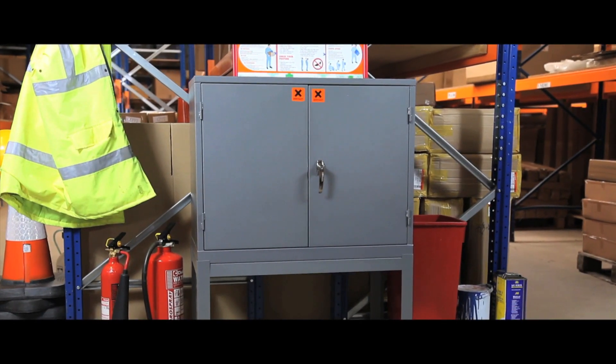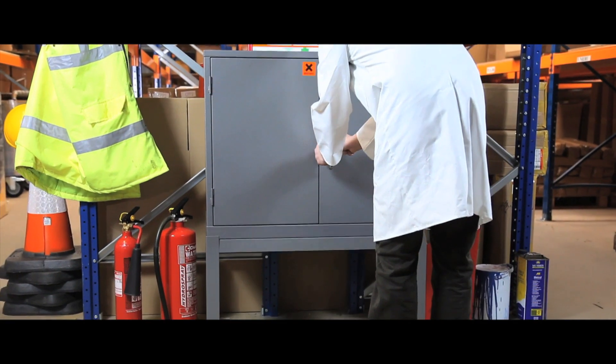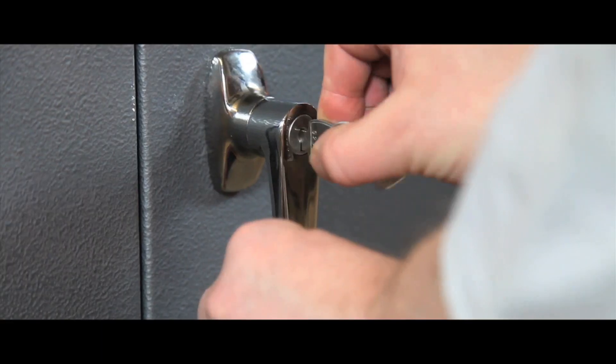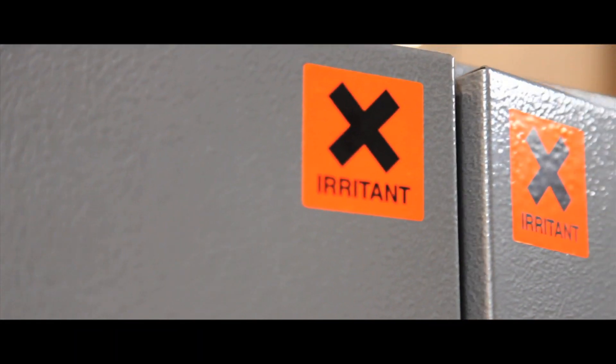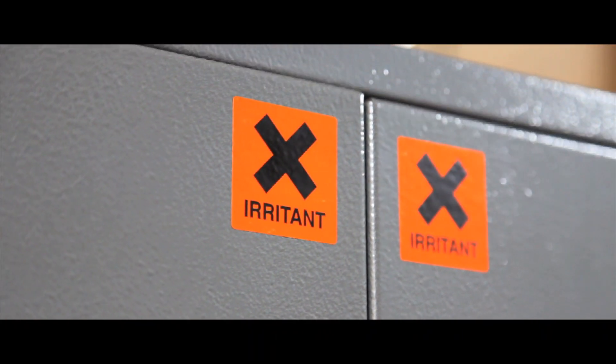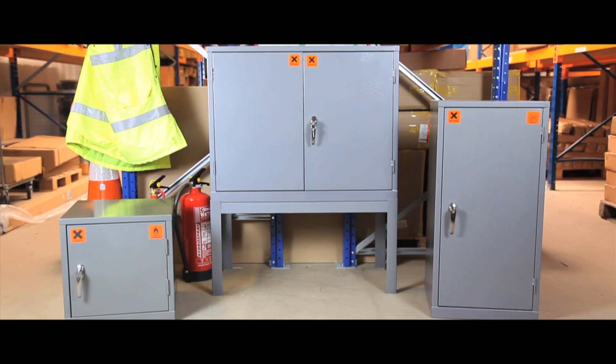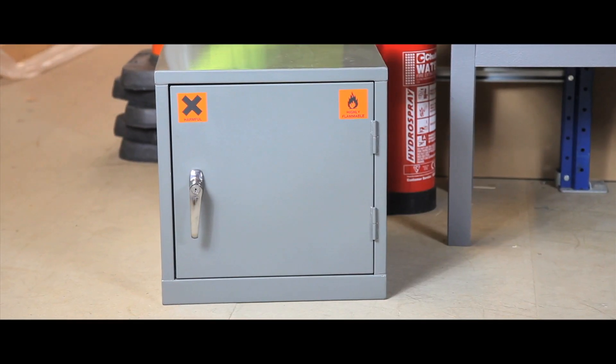Specifically designed to store hazardous substances, these cabinets are supplied in a grey hammer finish as standard and have high impact warning labels on every model. Available in a wide range of sizes, colours and styles.